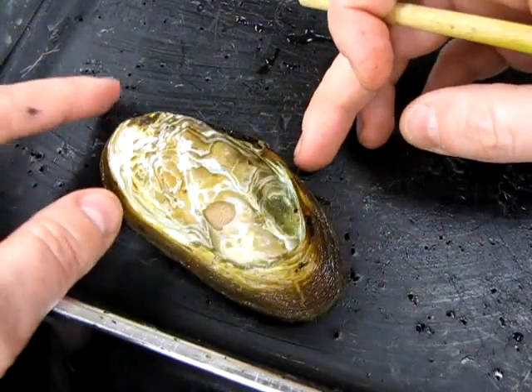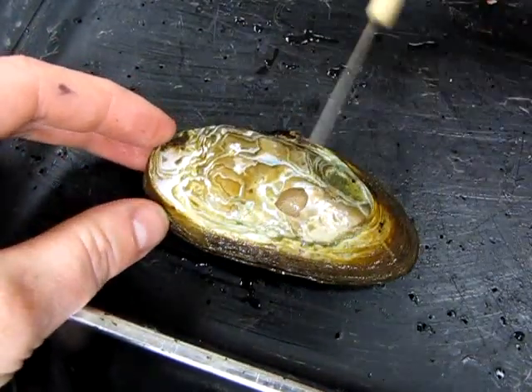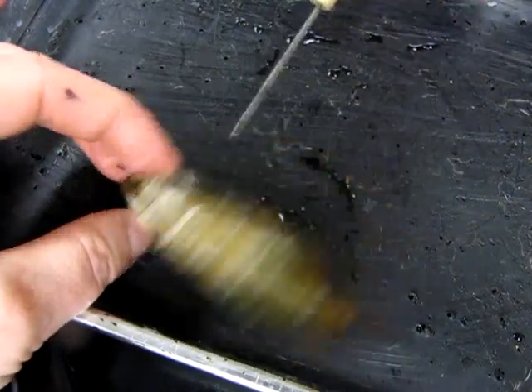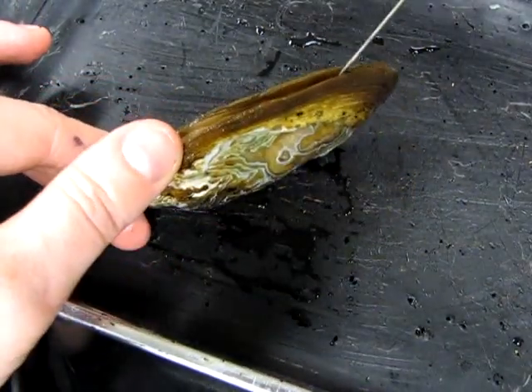This is a freshwater mussel, in the phylum Mollusca in the class Bivalvia. Bivalvia means two-valve, valve referring to these hard shells on the exterior of the animal. This is basically an external skeleton.